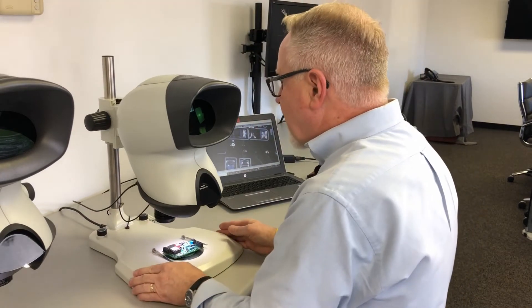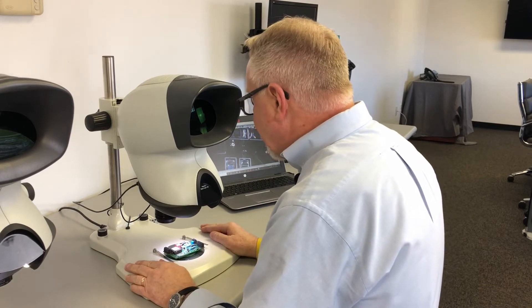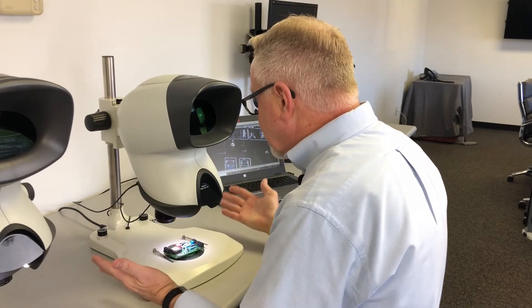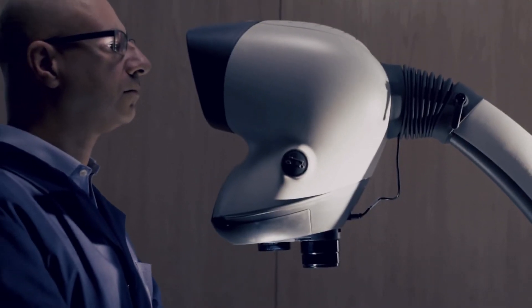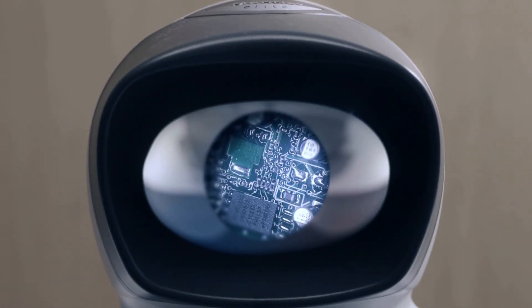With all Vision products, we pride ourselves on ergonomics. You have a stereo image but you're not married to eyepieces. You sit, look into the head and have a straight-on stereo image that's exceptionally high resolution and very bright.